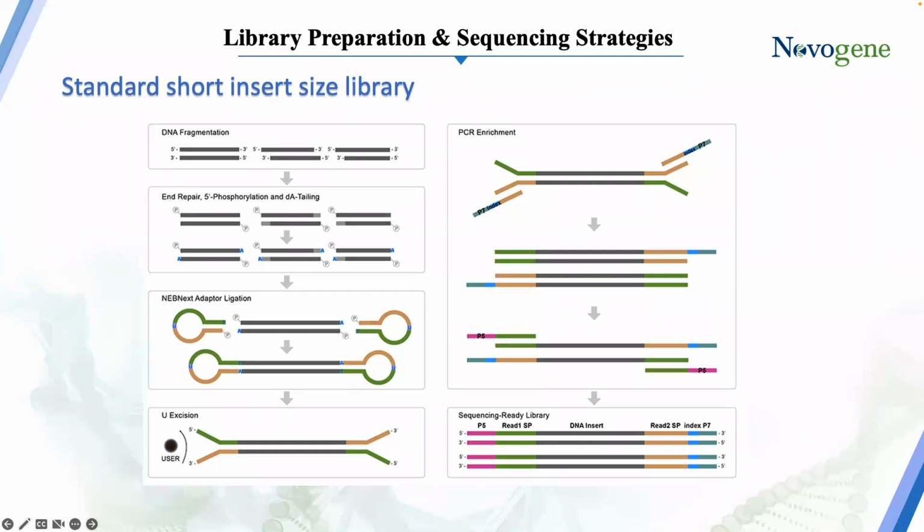So typically, this amplification process, you'll need to do this and make sure that the lane is actually loaded to its theoretical output, because when you load a sequencer, it has to be run with close to the amount of data output it's intended to put out, or else the run could have some things go wrong. So hence the reason for needing a lot of material for library.